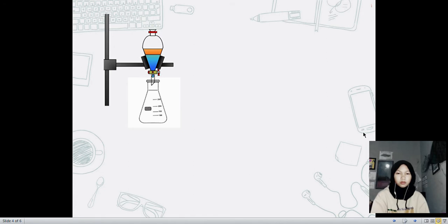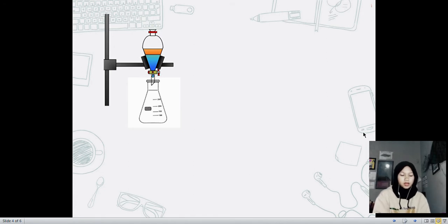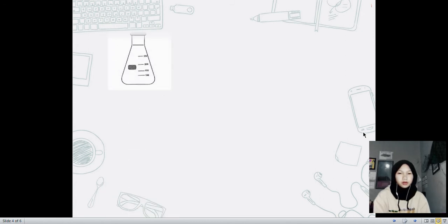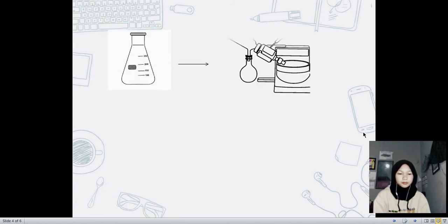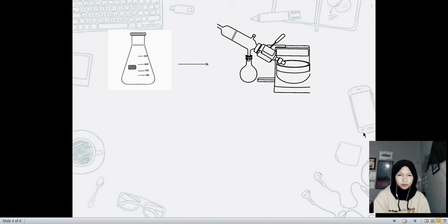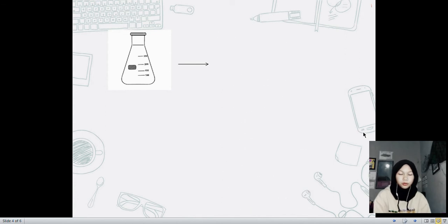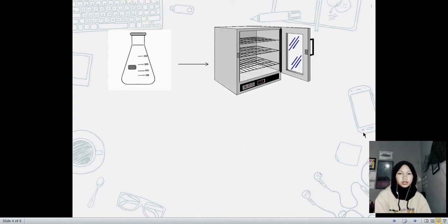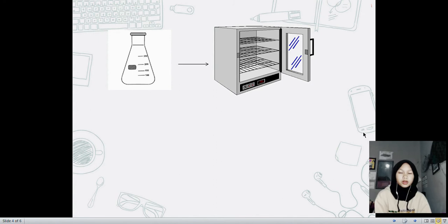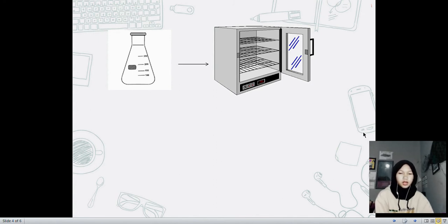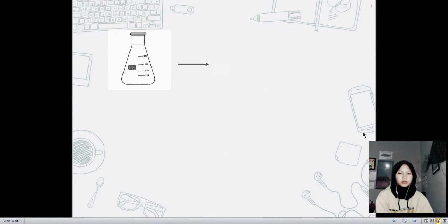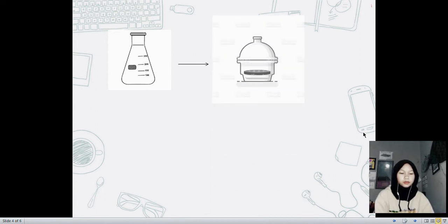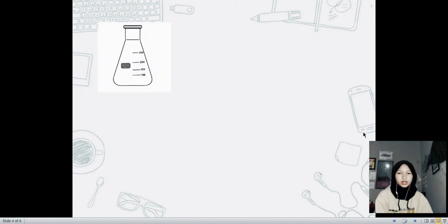Then we weigh it before and after. Put the Erlenmeyer flask into the rotary evaporator and put it back to the oven at 103 degrees Celsius to 105 degrees Celsius for an hour. Then leave it in the desiccator for 30 minutes and weigh the Erlenmeyer flask.